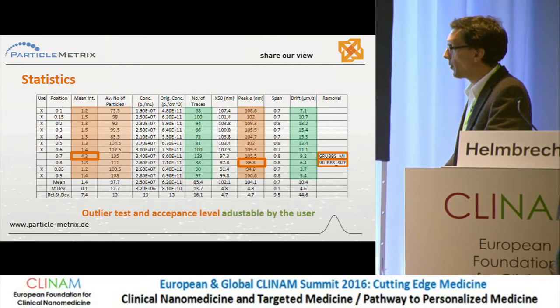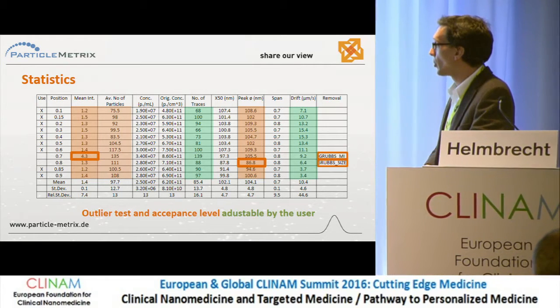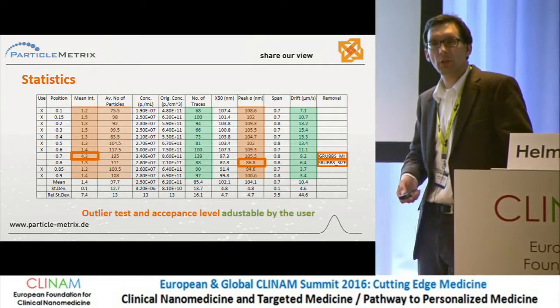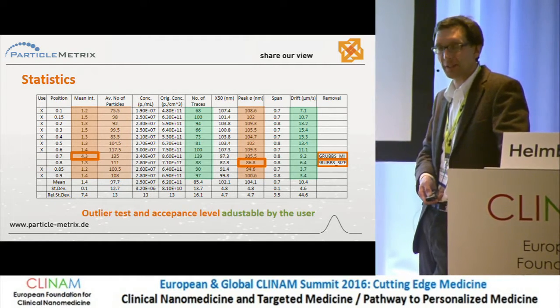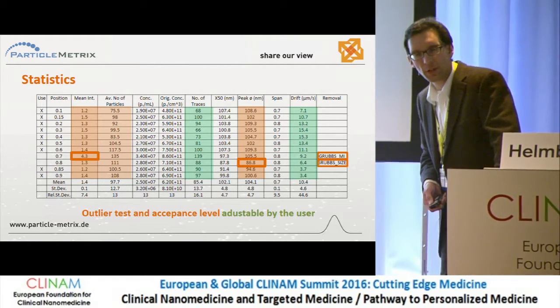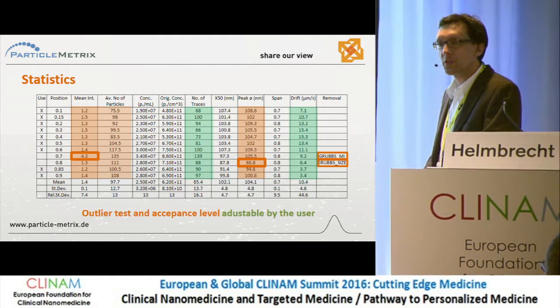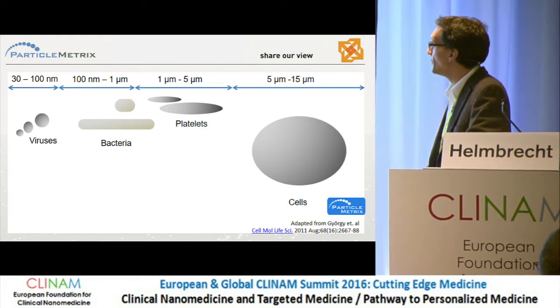As we are measuring through several positions, you have the outlier controls, and they directly say if something was wrong with one of the positions, and you can keep them, or most of the time it's better to remove them because they are real outliers which can be explained by statistics. So this makes the whole measurement more safe, and you're not prone to believe in artifacts.